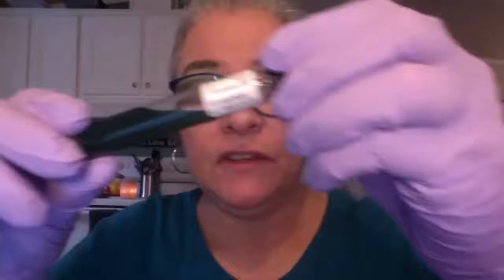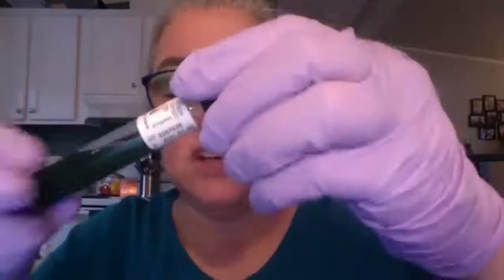I don't actually have inoculated positive tubes for the citrate slant agar, but I do have an uninoculated tube here. So you can see the slanted agar, and it's solid, yeah? And it's got this really deep green color.